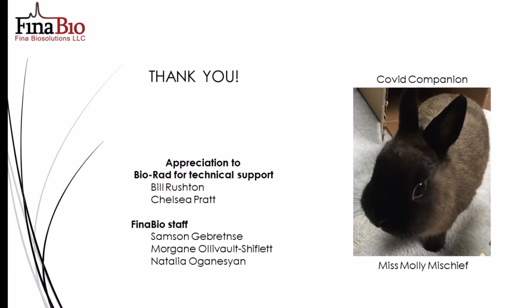And would you consider using an anion exchange hydrophobic interaction mixed mode resin for a possible one-step purification? We're definitely going to be looking at that. I like the concept because obviously one column would simplify things a lot. I would consider it highly unlikely that we would be able to get to a high enough purity with just one column, because we're loading whole E. coli lysate onto the first column. So it's unlikely, but it's possible, and especially for veterinary use, if we can get the endotoxin levels down, that's certainly a possibility.